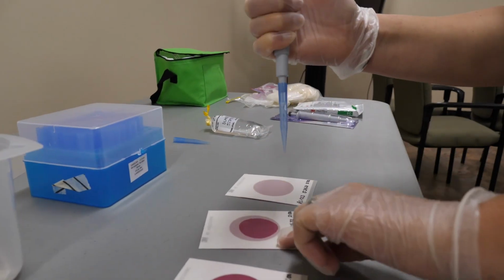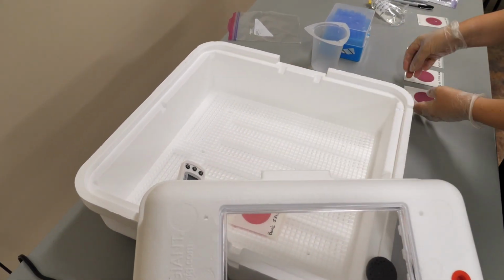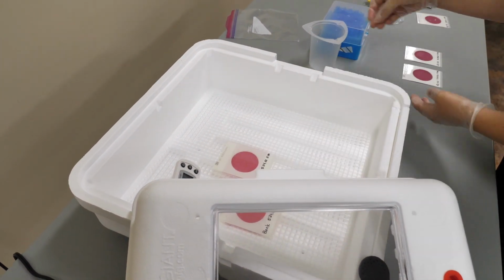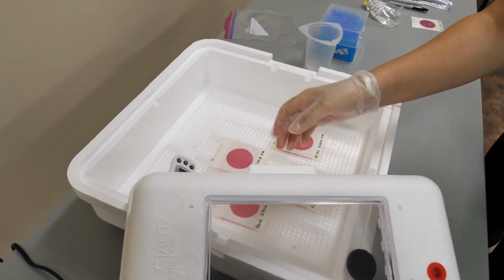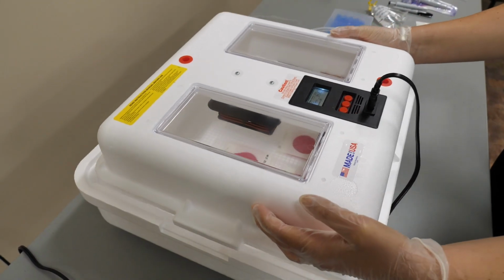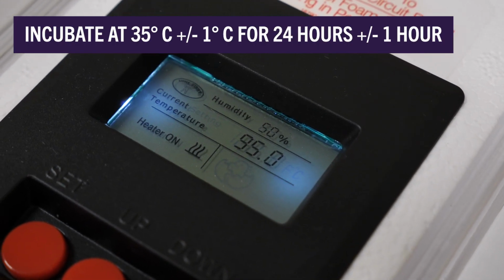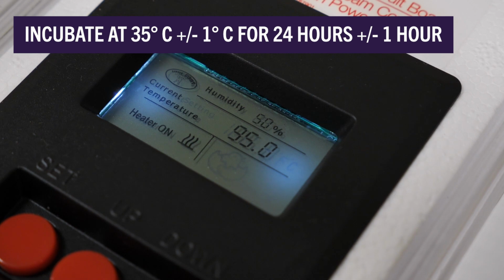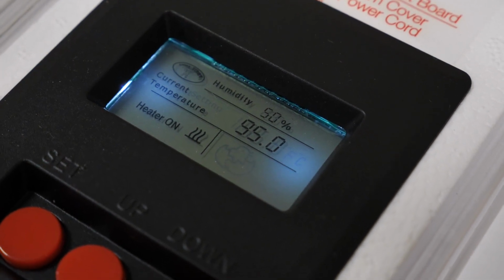Repeat this process for the other plates. Leave them to set for 1 minute before placing them inside the incubator. Plates can be stacked if you're testing samples from multiple sites at the same time. Incubate at 35 degrees Celsius plus or minus 1 degree for 24 hours plus or minus 1 hour. Wipe the work area with disinfectant.